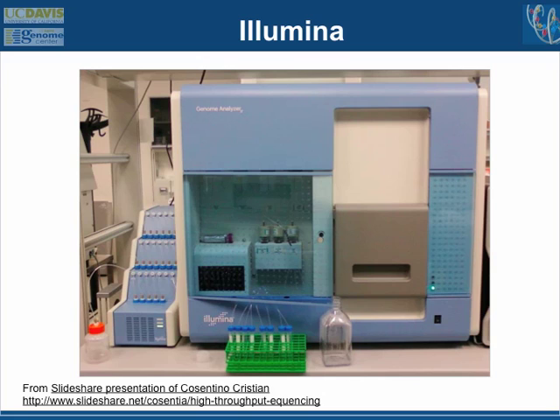Yeah. Basically, the same sample in all the wells, right? Each plate is one sample. So what you do is you take your DNA, you shred it up into pieces, and let's say you have 1 million different pieces of DNA from your original sample. Each of those ends up in an emulsion reaction, and then those get amplified. And now you have a pool of emulsion beads. Each one is a different piece of DNA, hopefully. And then you just pour those all into the little slide, and you run that all at once.